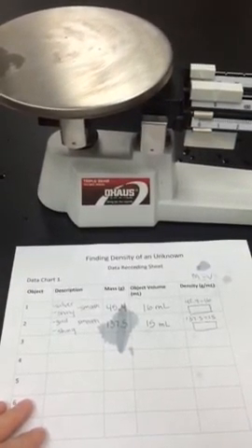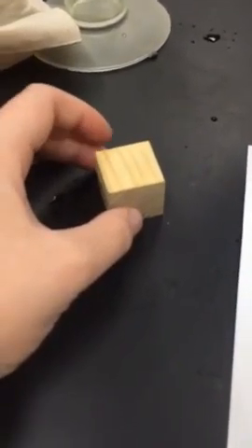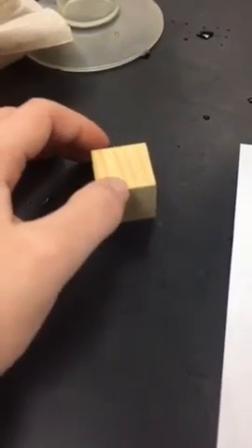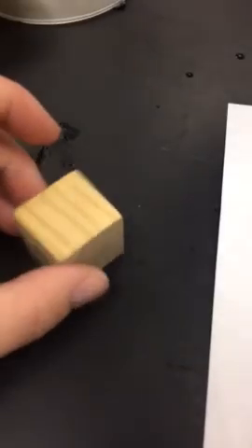This is a video about how to find the density of object number 3. So the first thing we need to do, just like our other two objects, is start with our description. If you look, you might have a hard time telling, but this object appears to be made of what? Okay, it does appear to be made of wood, but we can't say that. We just want to describe its physical properties.